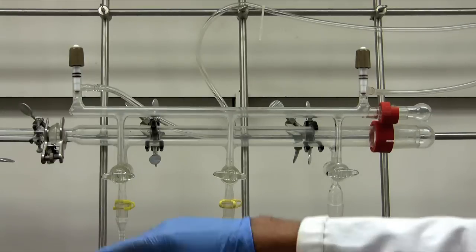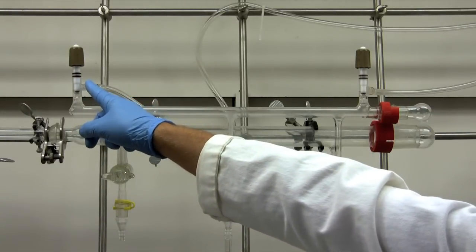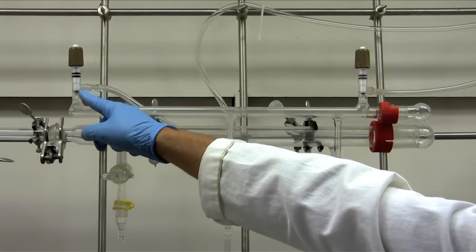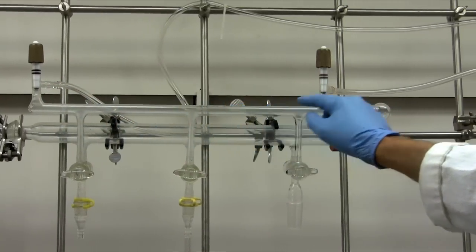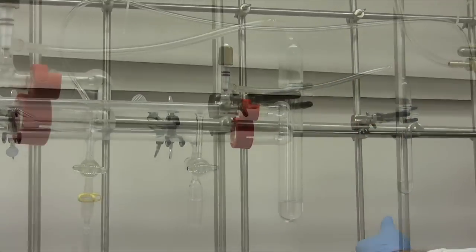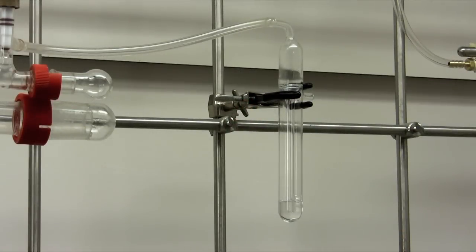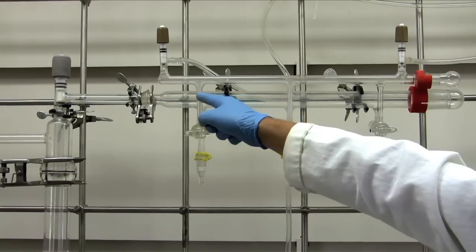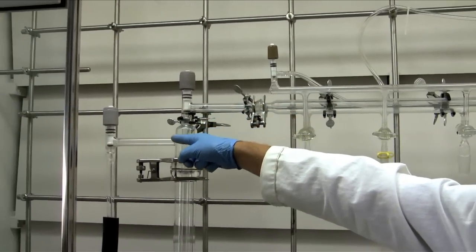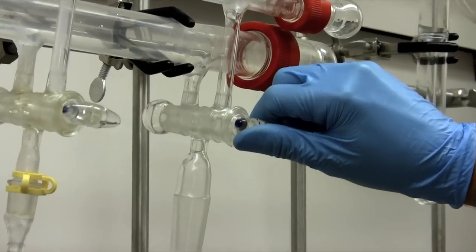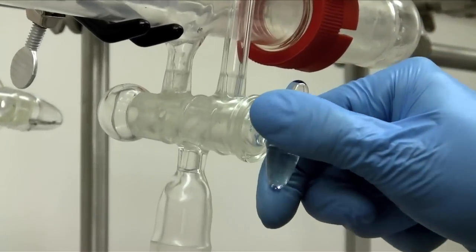The Schlenk line is designed to allow working under inert atmosphere. It's built from two parallel glass tubes. One tube is connected to an inert gas, and the gas is constantly running through the tube and exiting via a bubbler. The other tube is connected to a vacuum pump. The valves allow switching between vacuum and inert gas.